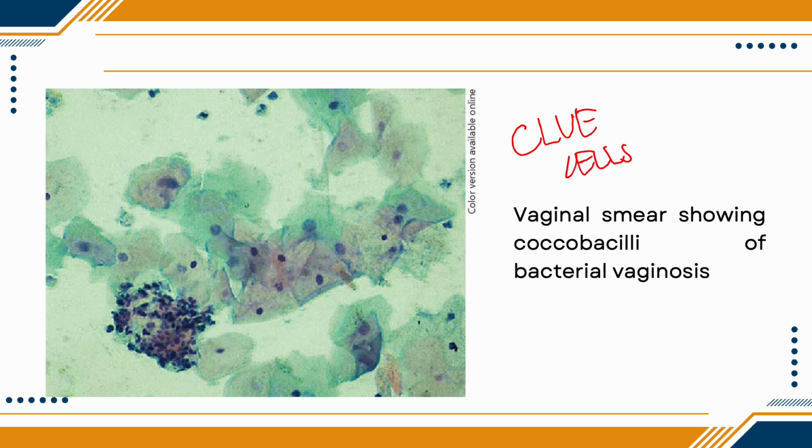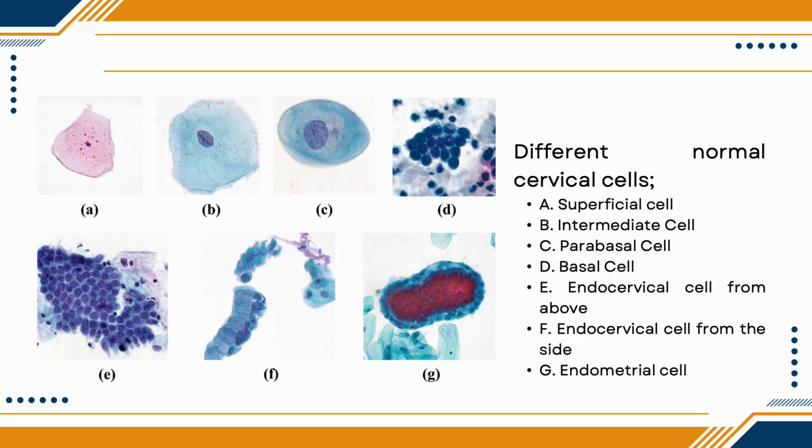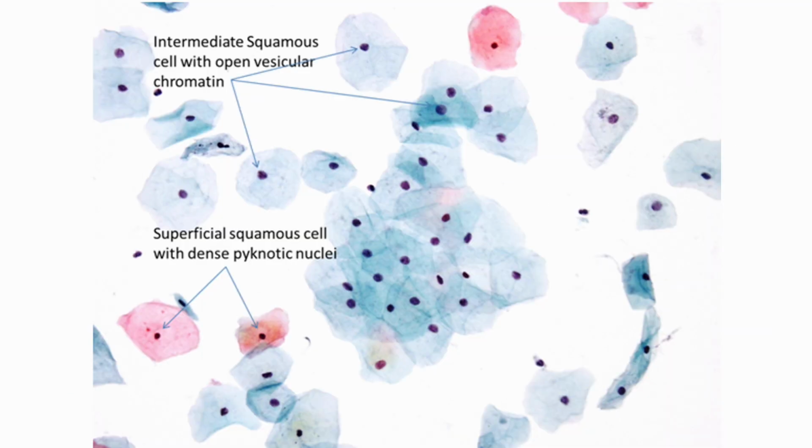Bakit clue cells ang tawag? Because they are a clue that there is a pathology, na bacterial vaginosis. So again, ito yun sila. So this is another image.